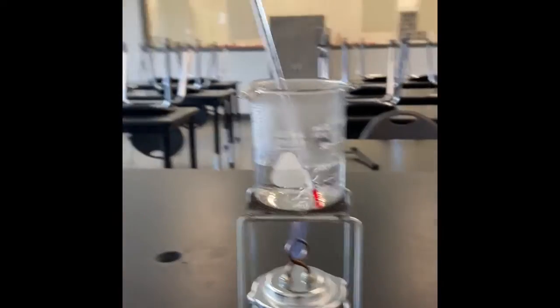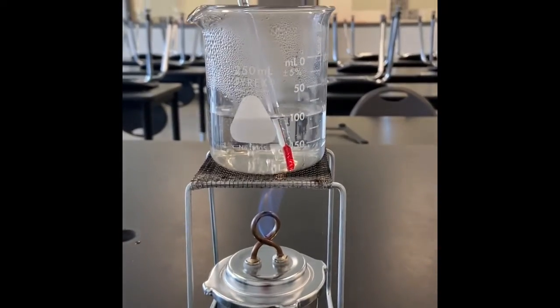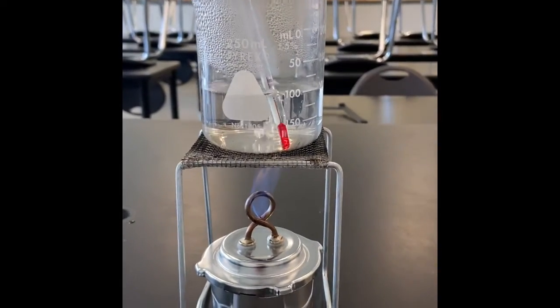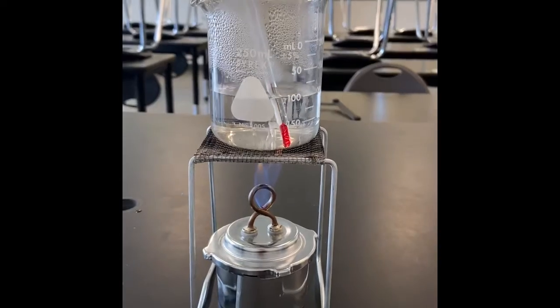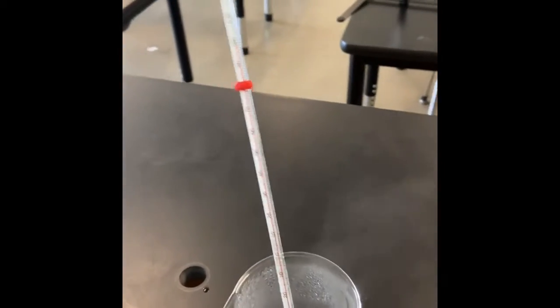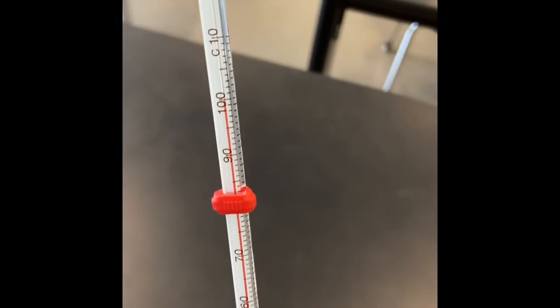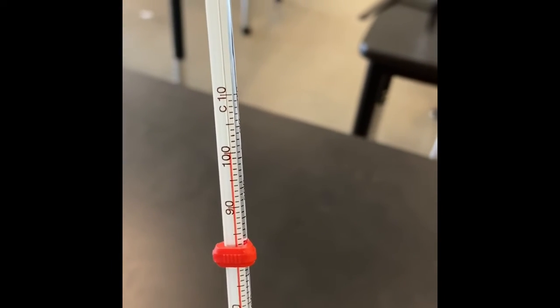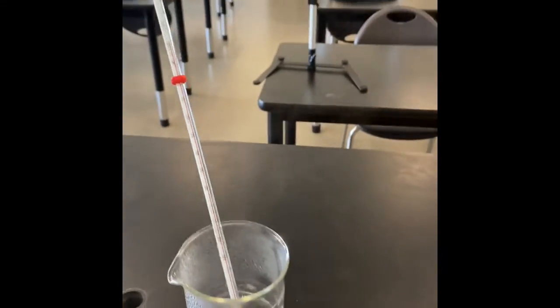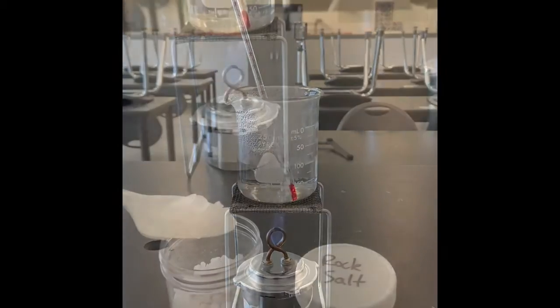All right, so now we're gonna look at the flip side of this. Again, I have a beaker of what is hopefully pure water. I got it out of my sink here in the lab, and I've just brought it up to a boil with one of these burners. Think about what you know already about the boiling point of water as we look at the temperature. It does look like it's right around 100 degrees Celsius. Does this fit what you already knew about the boiling point of water?